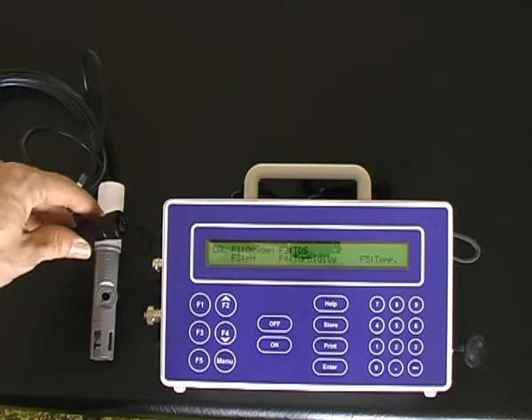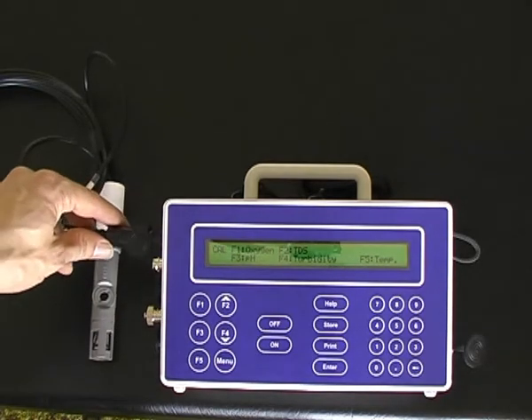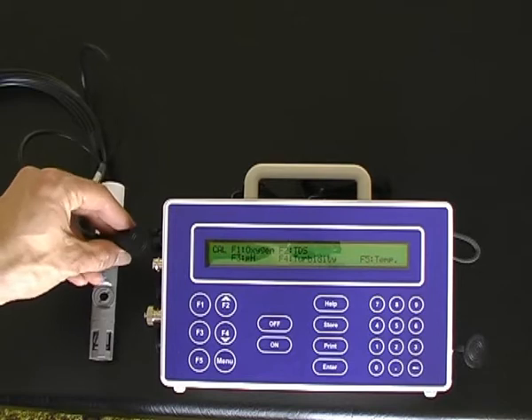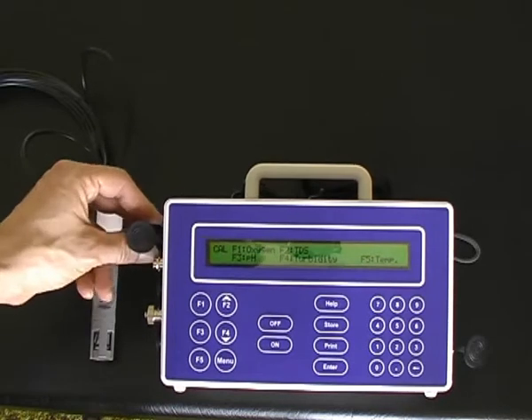First, connect the dissolved oxygen sensor cable to the 90FLT by plugging it into the correct socket, which is labeled.